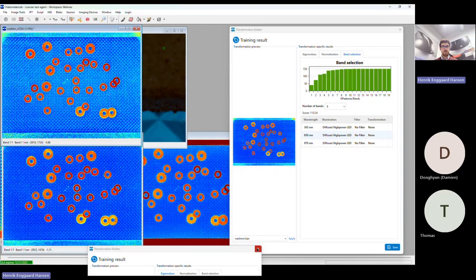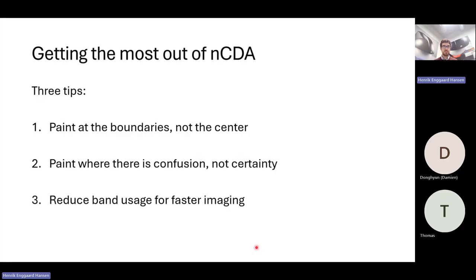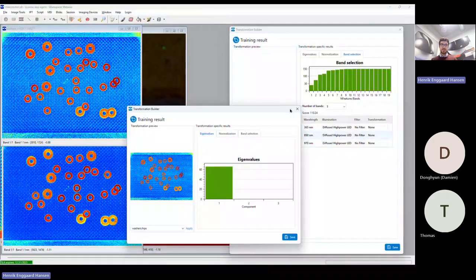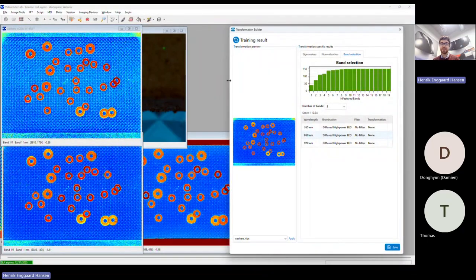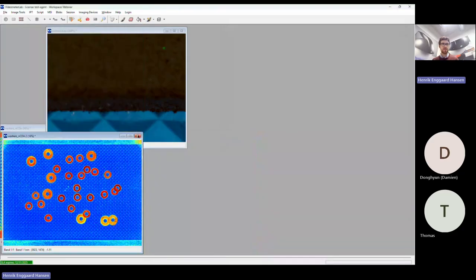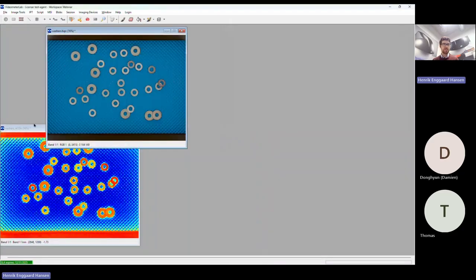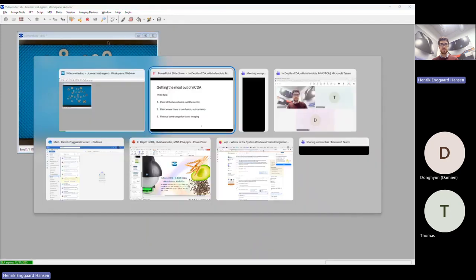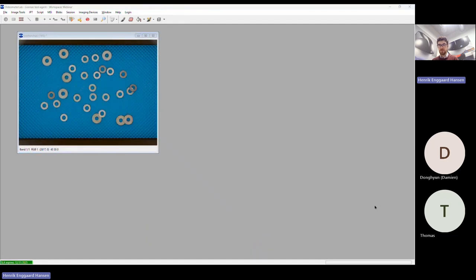So that essentially ends the planned presentation part. So now we have a few minutes if somebody has some questions about our toolbox, if someone is interested in having something demonstrated. And welcome to write a comment if you want to speak or something.